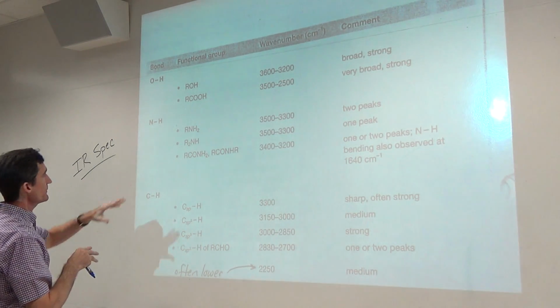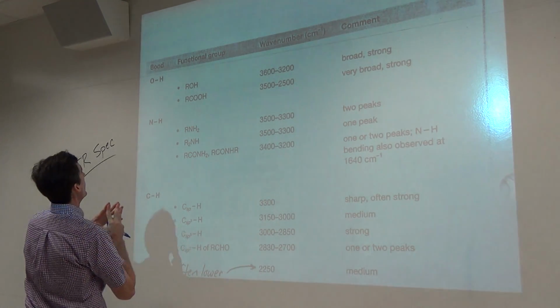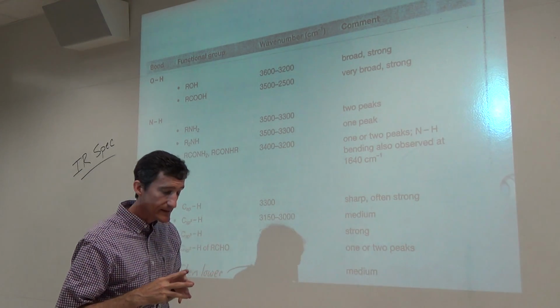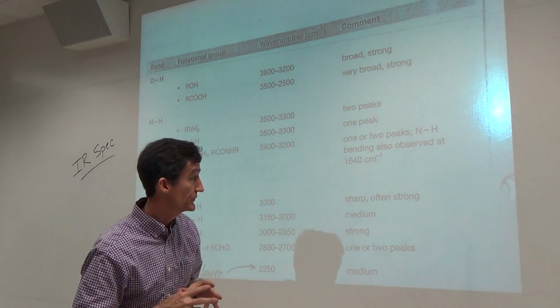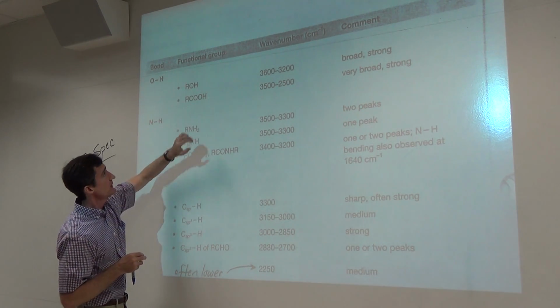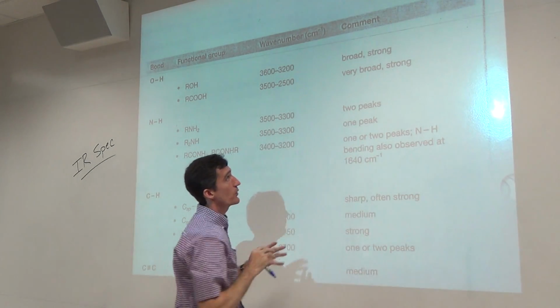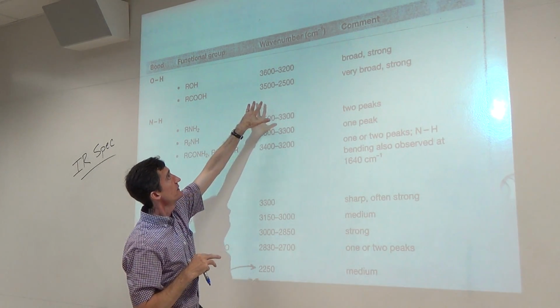Okay, let's start by making some comments about our bonds that contain a hydrogen. First off, you do need to know your functional groups. The reason we teach IR at the beginning of organic chemistry here at GRU is because it goes hand in hand with learning your functional groups. Your alcohols and carboxylic acids, they both contain an OH group. OHs tend to be pretty broad and strong. We saw one of these in acetaminophen. Here's the range.